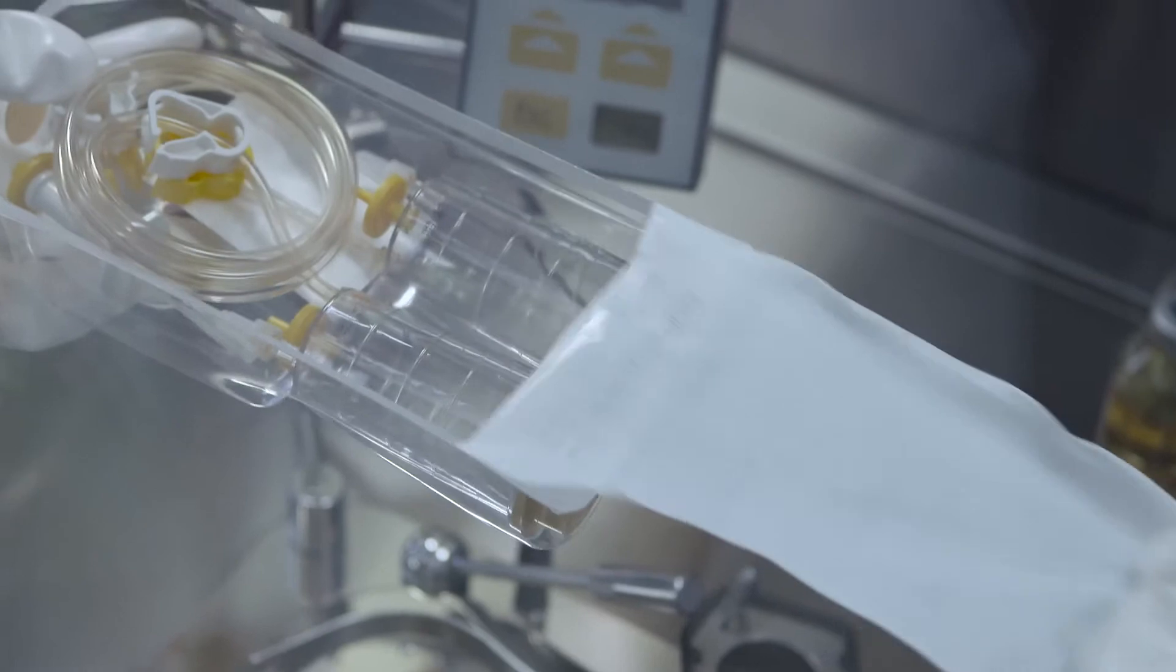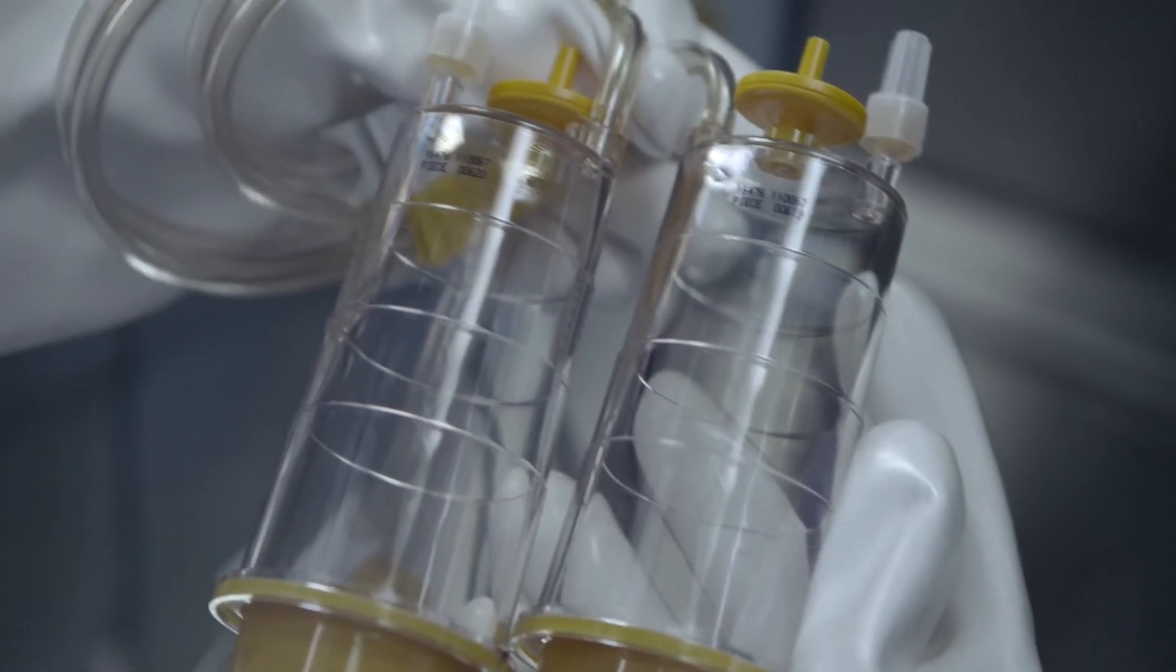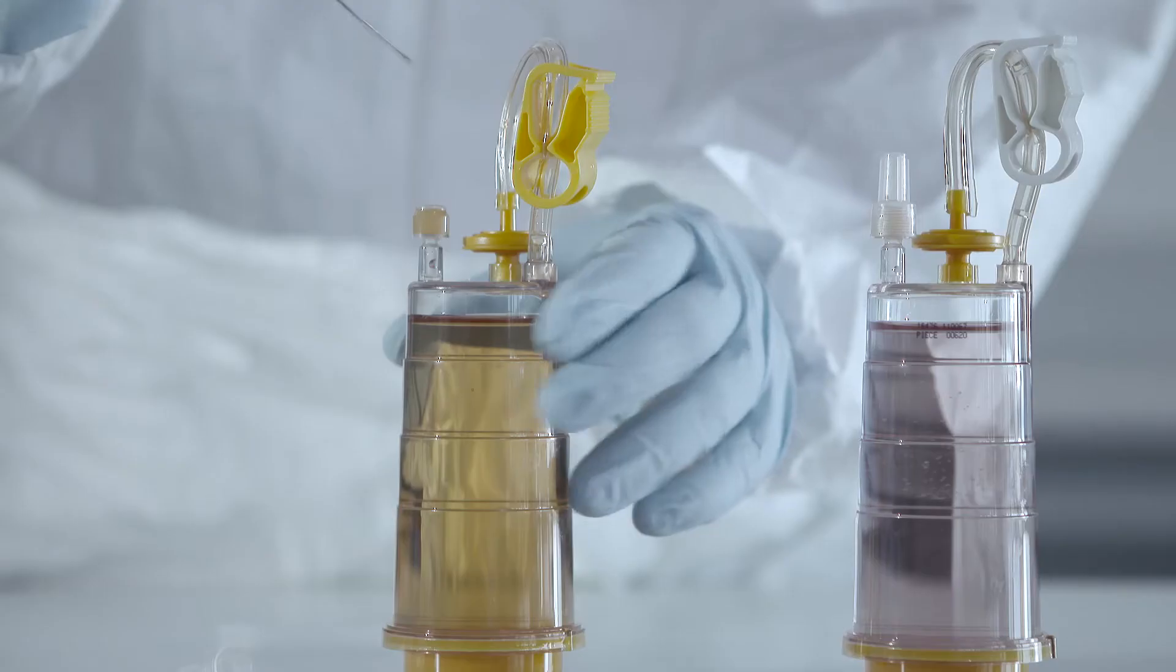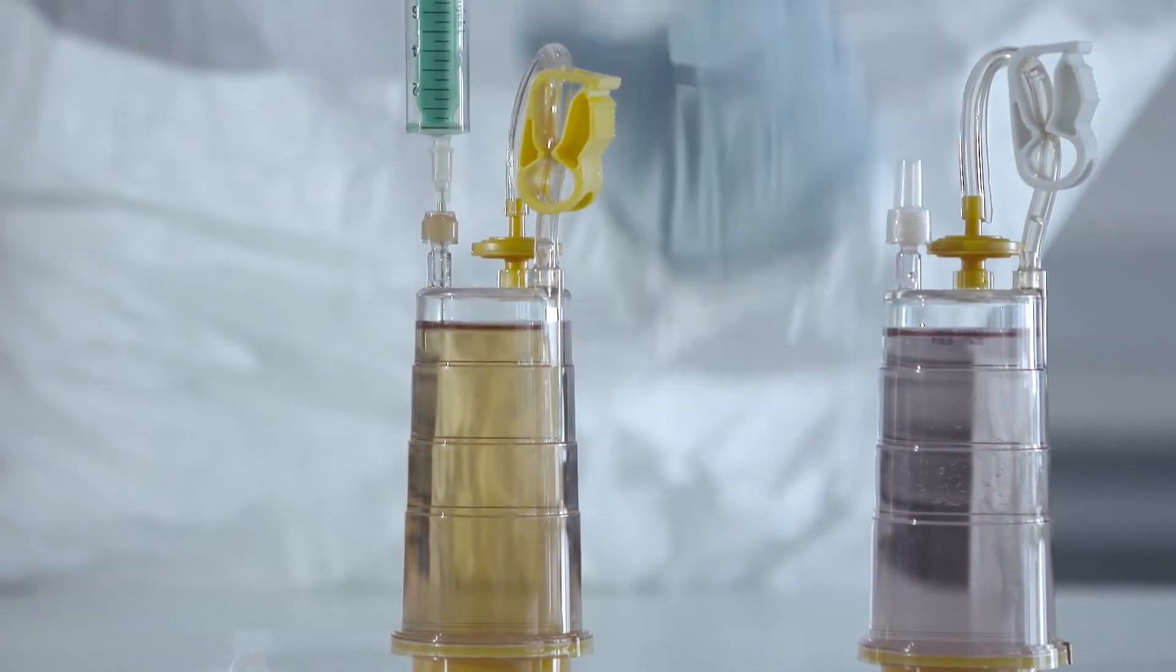There are more than 20 different pre-sterilized Sterisad NF disposables. They offer features like a unique septum version for aseptic sampling and supplement.